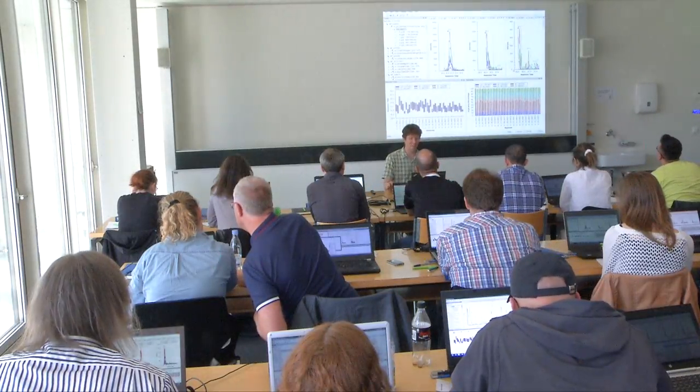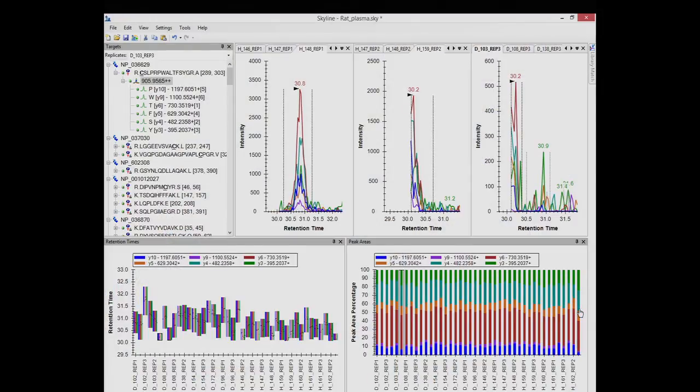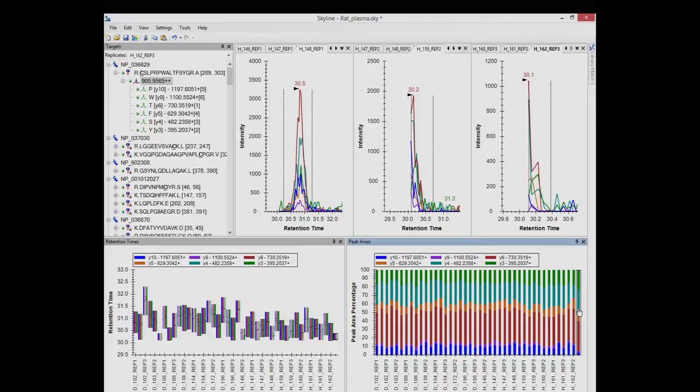And I would say that now we're pretty close to being done with this peptide. The one last thing I would probably look at is this one way on the end. And you can see again that it's a truncated peak. So it looks different. You can see now that the things that are truncated have shorter retention times, and they're close to, you can now imagine our scheduling border here at 30 minutes, or a little bit after 30 minutes, and you can see the things that are butted right up against it. So we're seeing a little bit of signal drift.